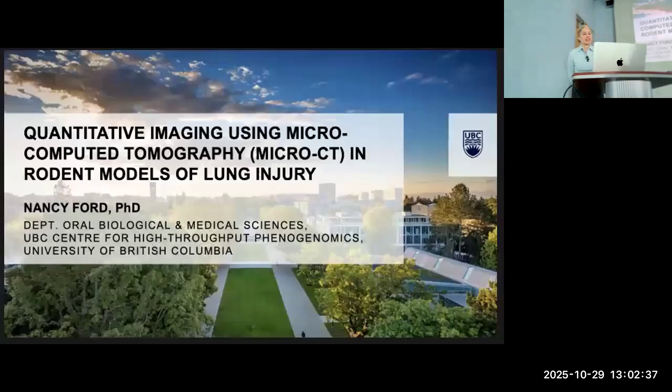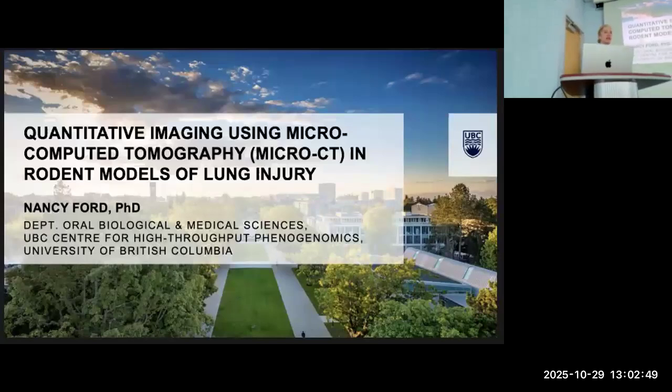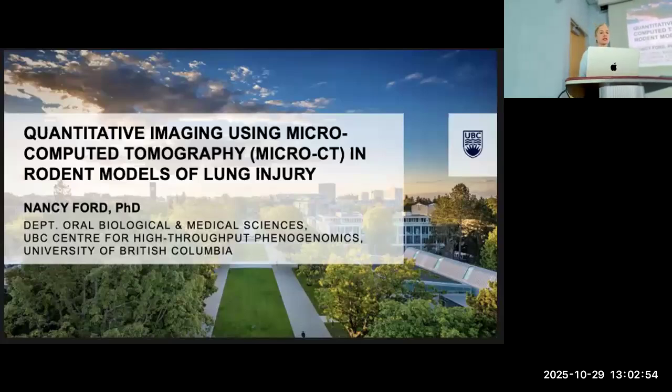Great, thank you. So today I'm going to be talking about quantitative imaging and how we use microcomputed tomography to look at characterizing changes in tissue and also how that affects function in preclinical models of lung injury.